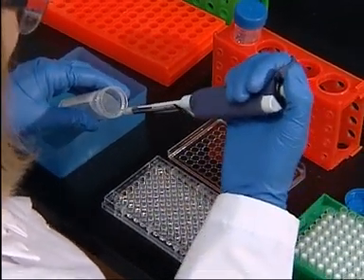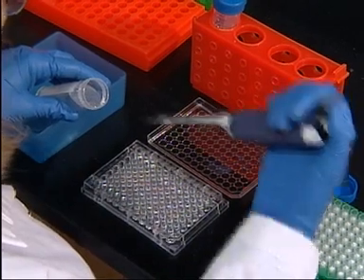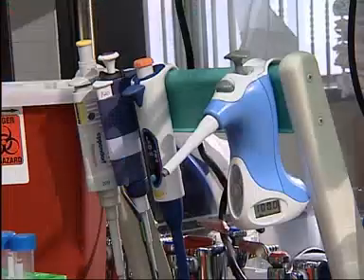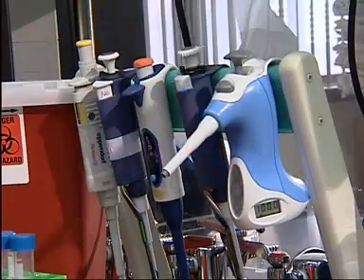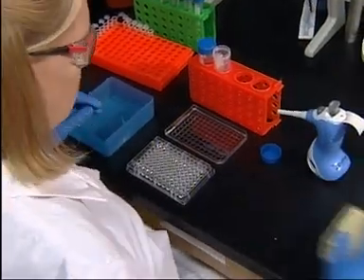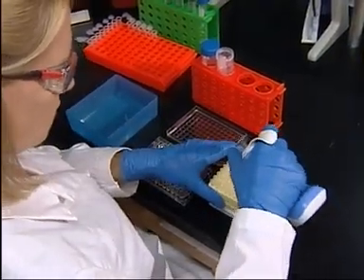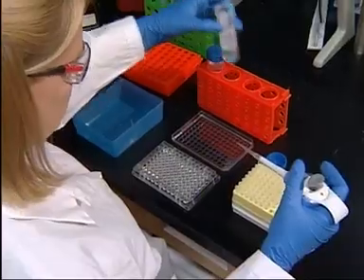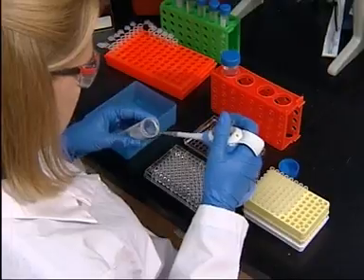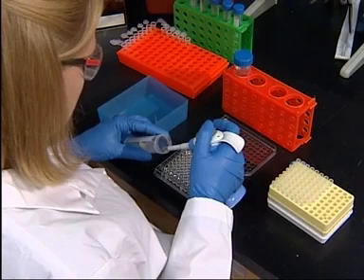Several musculoskeletal risks are associated with pipetting. Learn to recognize and avoid them. Start by selecting the best pipette for the job. Choose a pipette that is a good match for the size and shape of your hand. Look for a lightweight model that you can comfortably grasp. Models that are slightly smaller than the diameter of your hand are easier to grip. Finger hooks are useful for resting your hand during the pipette cycle. This can reduce tendon inflammation and nerve compression, which in turn can reduce the risk of nerve injuries and tendonitis.